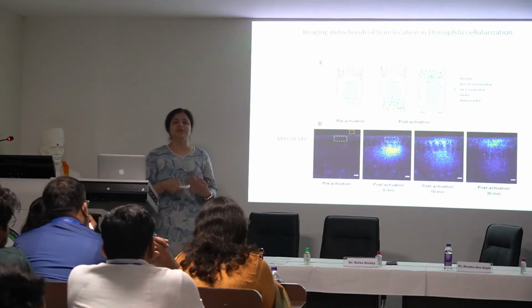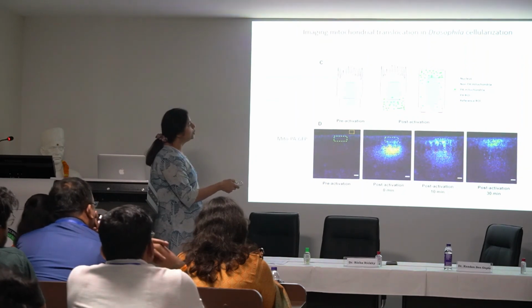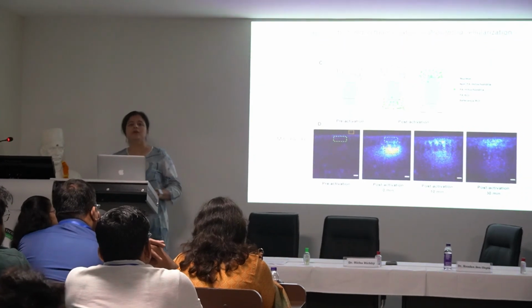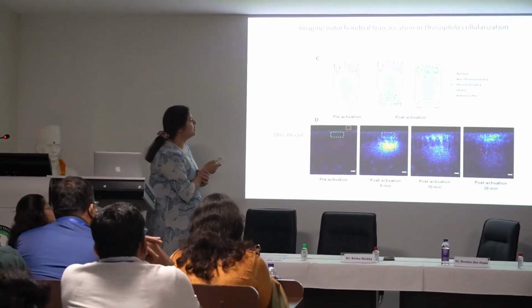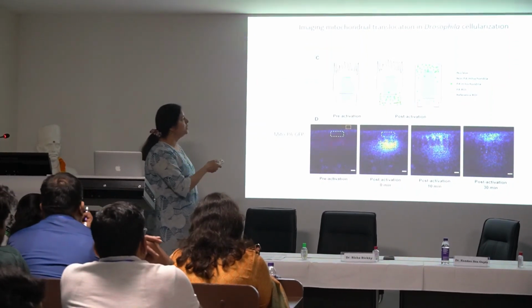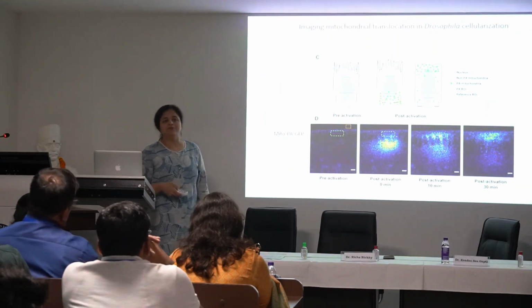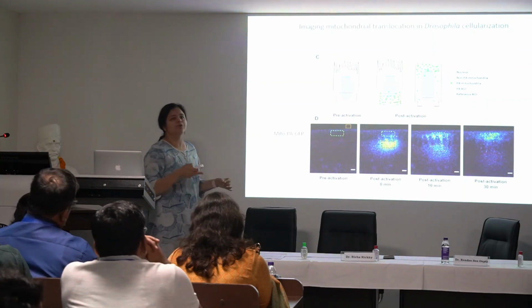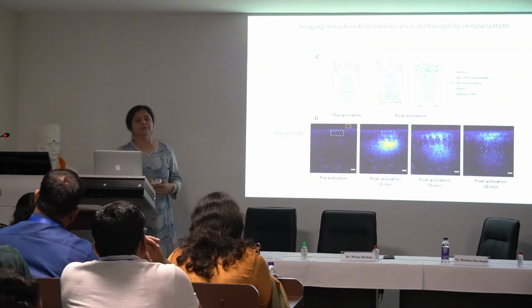And also there is a change in activity of these mitochondria. So what we see is that this closing off of cells is aberrant in this particular system if the mitochondria are big and dysfunctional in their activity. That is something we could show in this study. The mitochondrial function which leads to an aberration in these big fused mitochondria was a decreased production of reactive oxygen species.